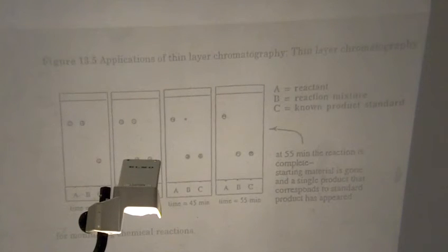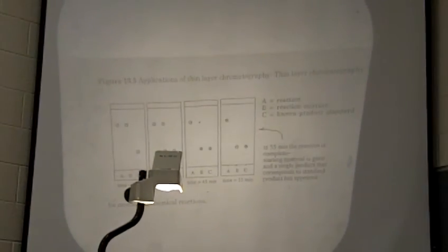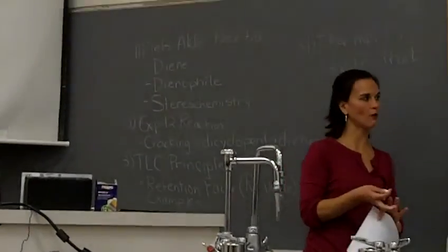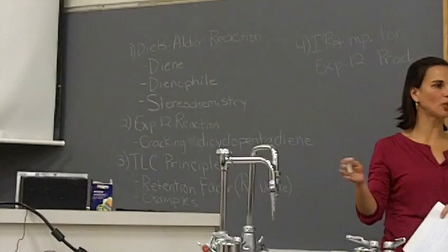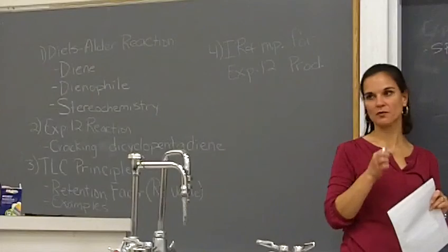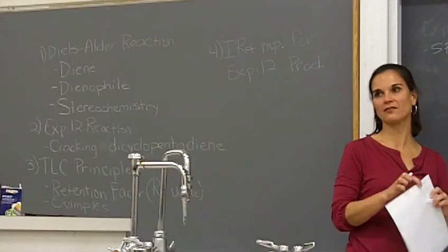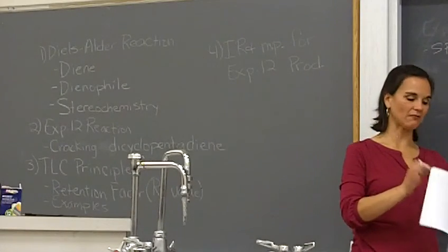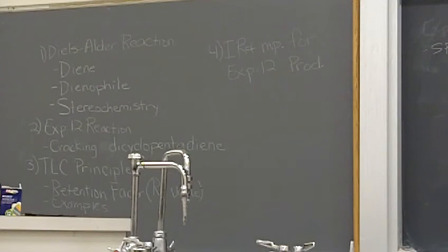Another thing that TLC can be used, and you use this next semester, is actually for column chromatography and monitoring what's going on with column chromatography, okay? So we'll use it multiple ways next semester for monitoring reaction as well as monitoring what we call running a column. So what you learned this week, don't forget it. You need it for a good portion of next semester, okay? Including learning how to pull spotters, which is maybe the most difficult part of this whole thing, is the dexterity and the, like, just the right pulling and heating of these fine capillaries to make the right spotters, okay?